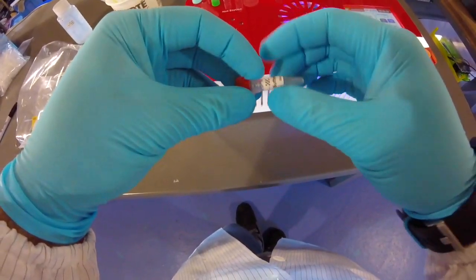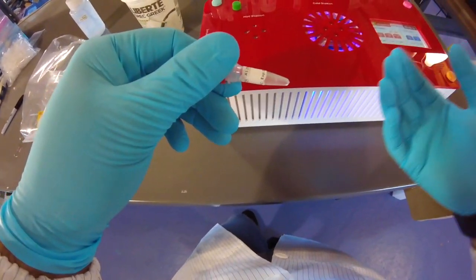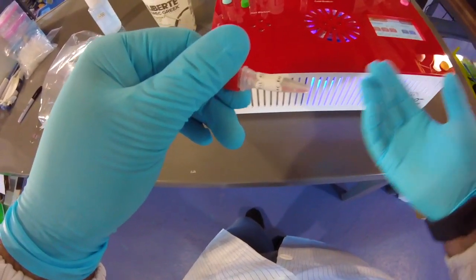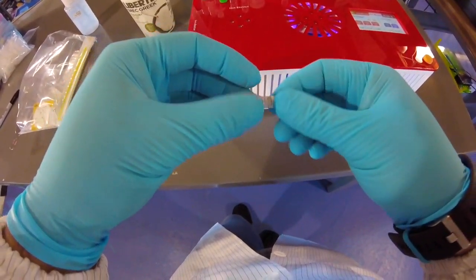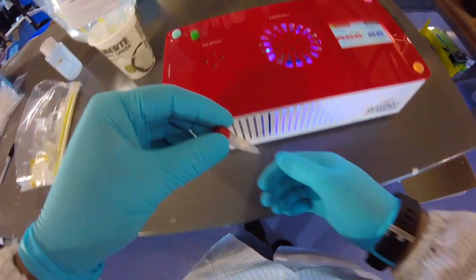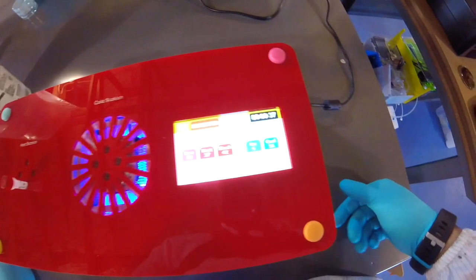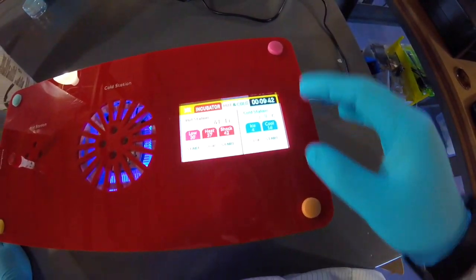Now your cells are mixed into the recovery media, which again has diluted the calcium so that it's not such a high concentration and dangerous to the cells. And we've added the growth media, right, which is the sugars and minerals and amino acids and things like that. So I'm just going to give it a little whip, make sure all the liquid's in the bottom, and we're now going to set this in the hot station for, again, up to 24 hours. You can see it's still at 41, but that's no problem. It's going to cool down pretty soon.